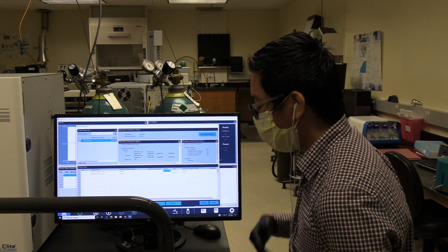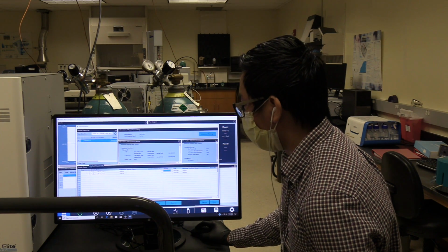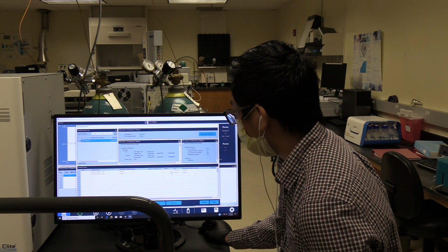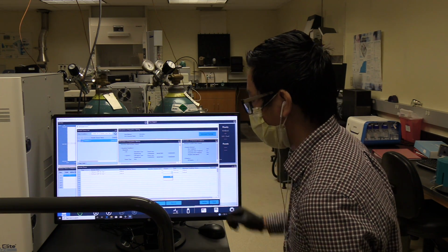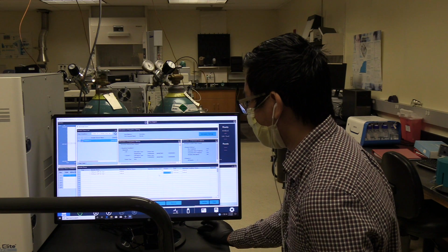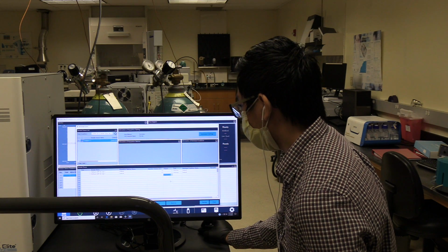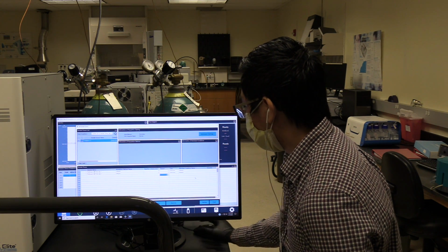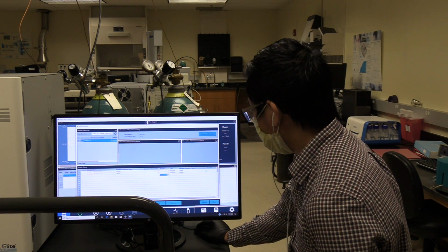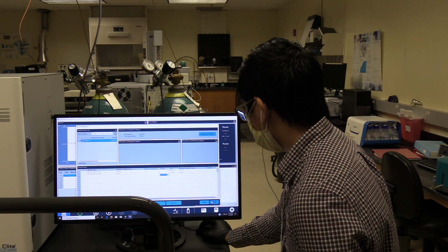If you want to inject more than 3 injections from the same vial location or cup location, I would make another line right here, as you see here, copying the exact same information, and then enter the number of times I would like to inject from the single line. For each individual line, you can only do a max of 3 injections. So if I wanted to do 9 injections, I would make another line and set it as 3. Individual condition will dictate how long my analysis time is, and also how long I will be doing my acquisition. And then there's also a remarks column for any comments you might need to make.